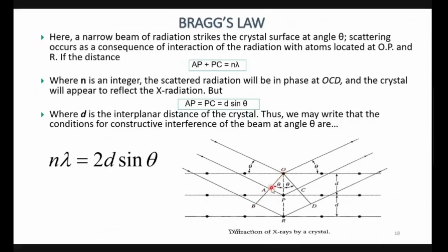Now at this particular wave front, all these three waves are in the same phase. Similarly, from this point O, they have drawn a perpendicular on the wave that is bounced off from P and R. Let me clarify that. These are perpendicular. This is a 90-degree angle.